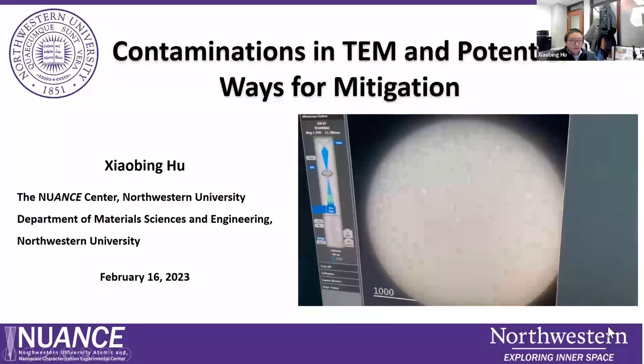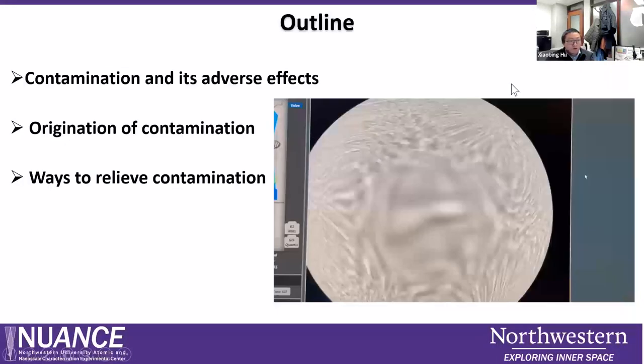Okay, now let's move on. Today my talk will cover several things. One is what contamination is and its adverse effects. The second topic is the origin of the contamination. The third is ways to relieve contamination.